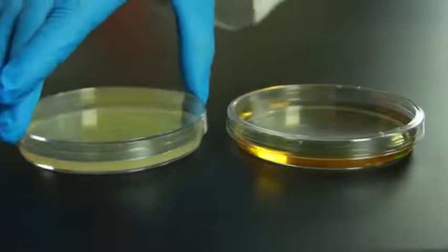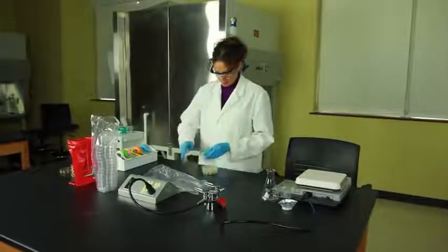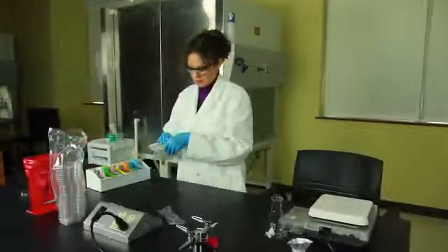The Petri dish on the left has set up properly. Turn the plates upside down to prevent moisture from condensing on the agar surface and store them in a plastic bag until you're ready to use them.